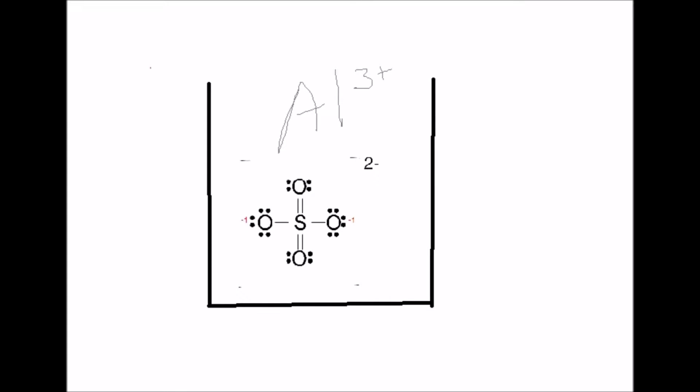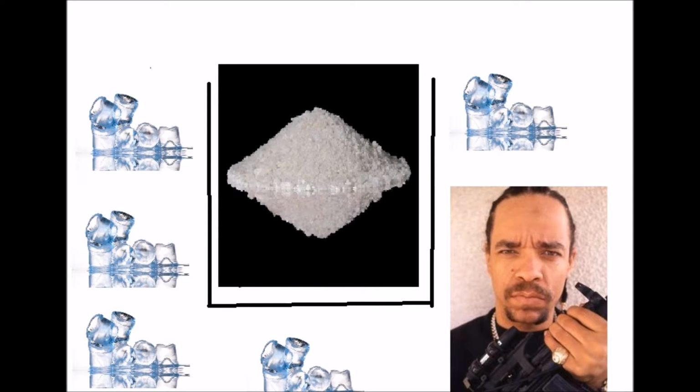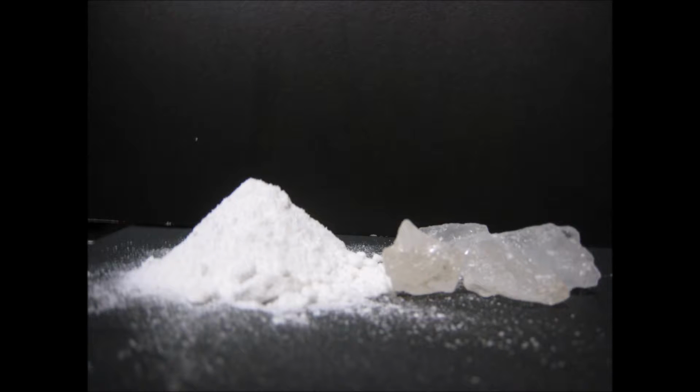After all of the aluminum hydroxide had dissolved, the solution was set aside to cool down. After it had cooled down, it was added to an ice bath. This cooling of the solution helped to precipitate out the alum. After the creation of the alum, it was time to make the actual alum crystals.